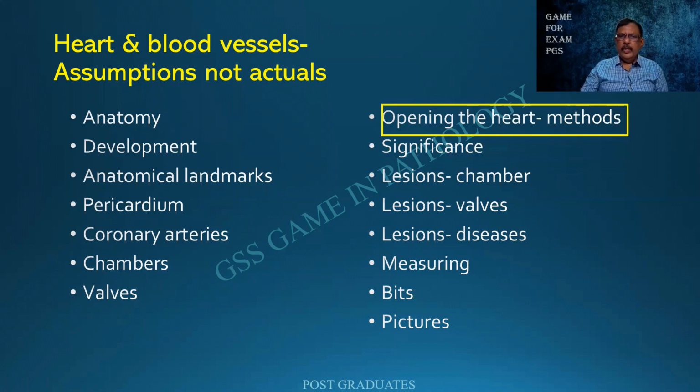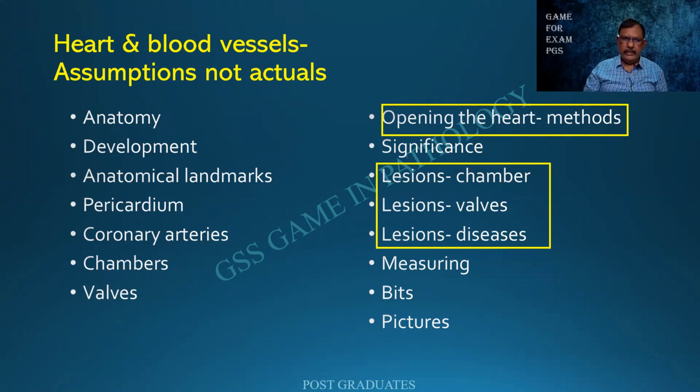Of these, this is something that will be not harassing us, but a constant battery of questions. Opening the heart, what are the various methods? And secondly, when we do answer, whether it is a specimen or the autopsy, these shall be asked. The lesions shall be chamber-wise, it can be valve-wise, it can be disease-wise.